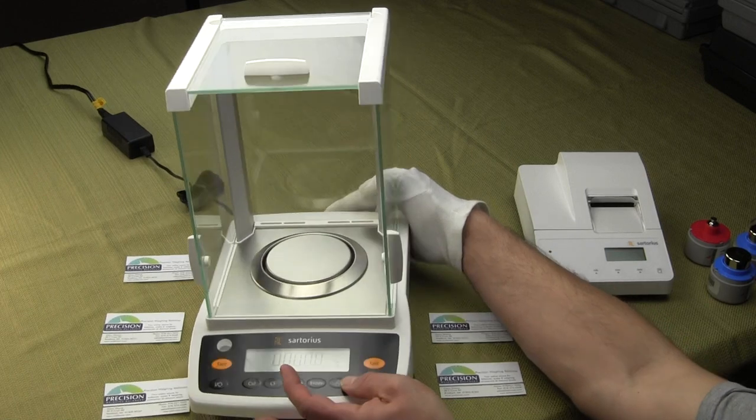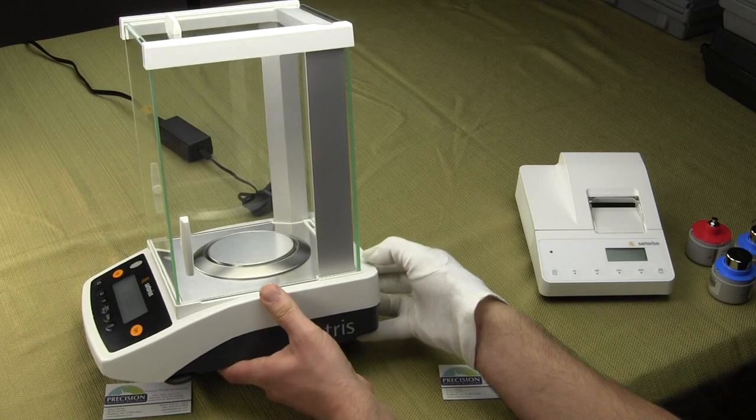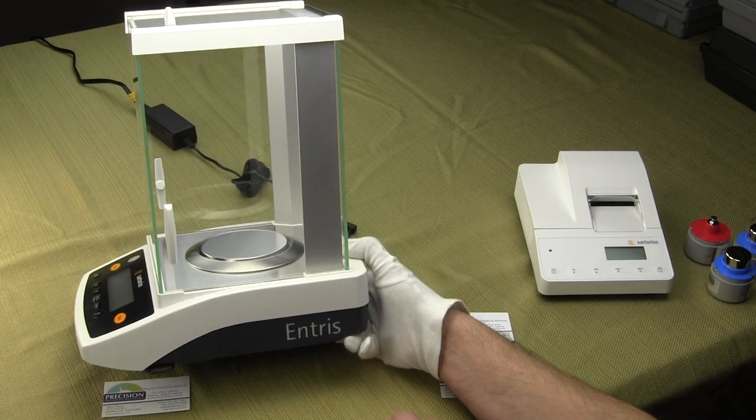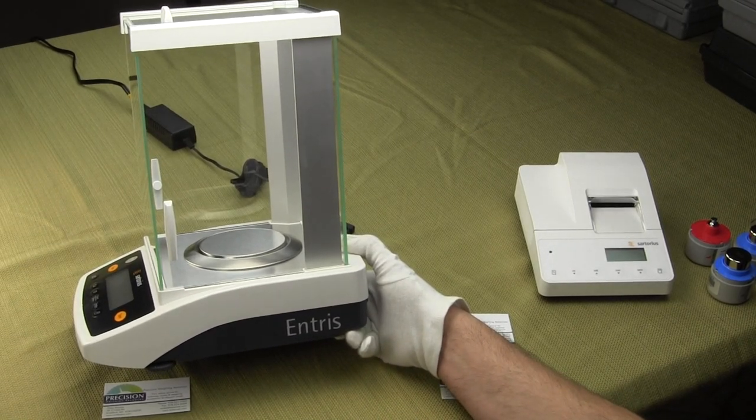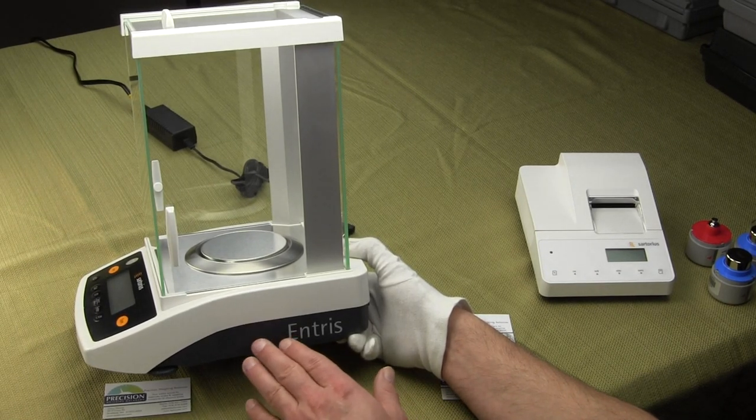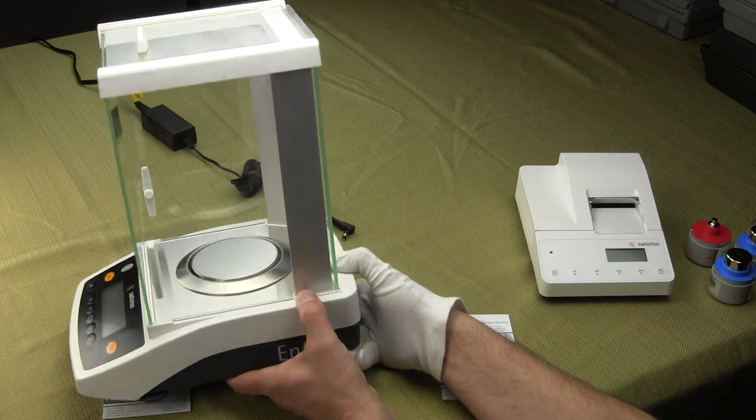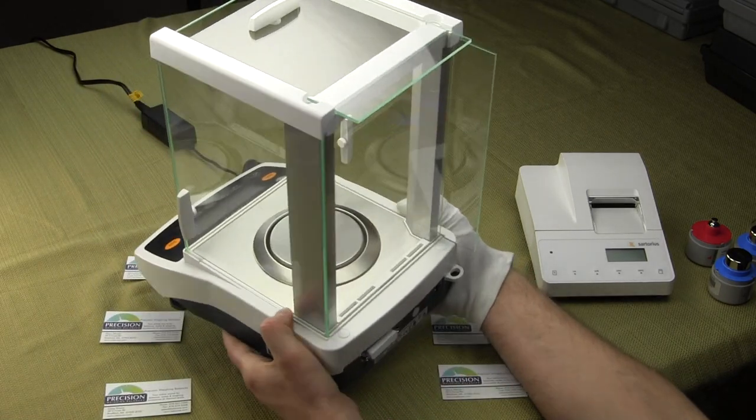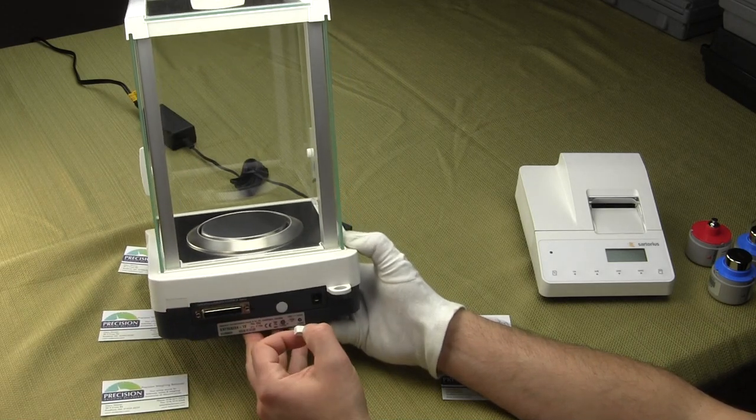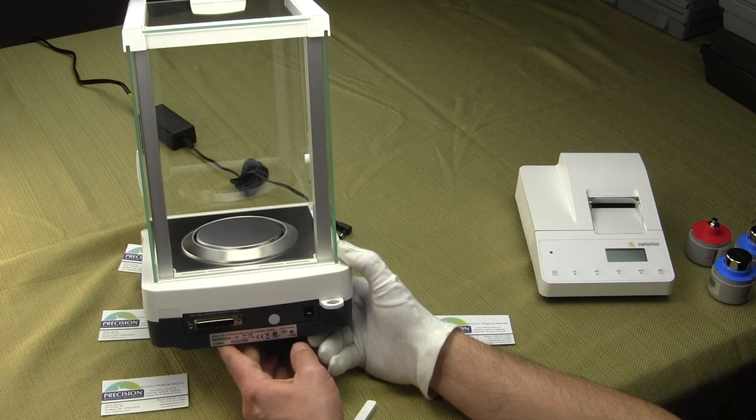Going over the side of the balance, as I mentioned, Sartorius marks it as Entris series. This is how they're doing all their new balances. If you buy a Practum series, a Quintix series, or a Secura series, the theme is to have the series name screened on the side of the balance.